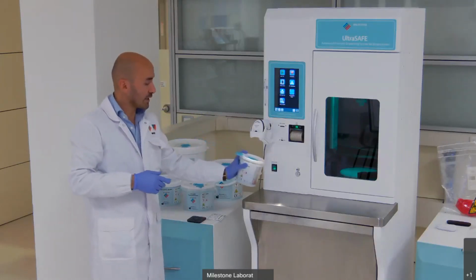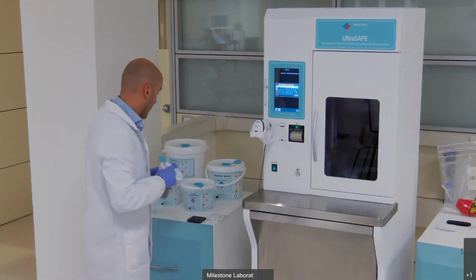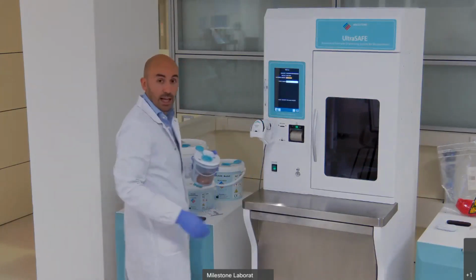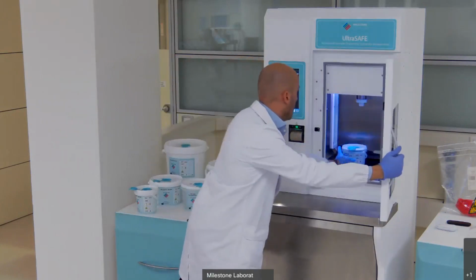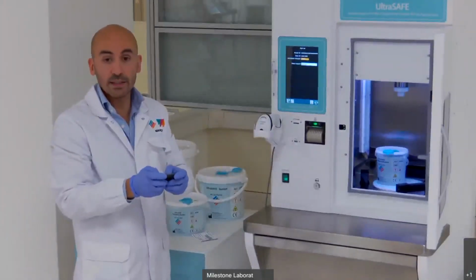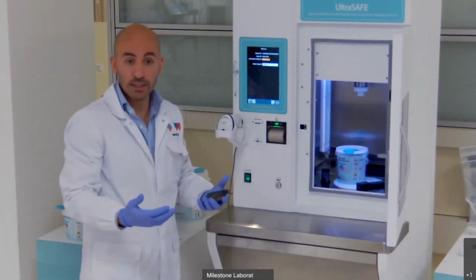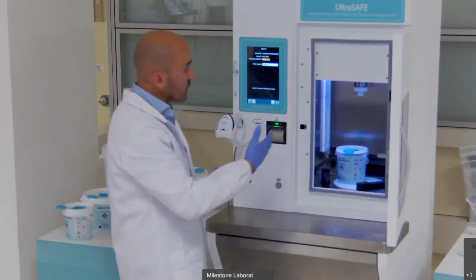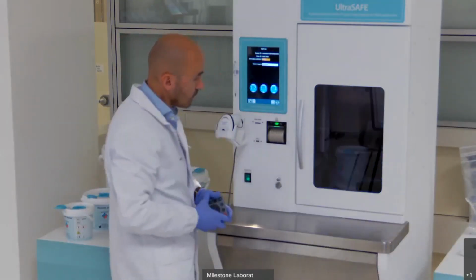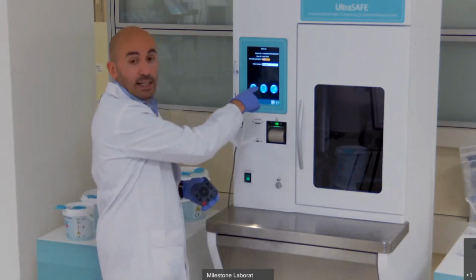As in the previous instrument, I need to scan one of the barcodes on top of the bucket, scan the requisition form of the patient, and place it on top of the scale. I will just slightly zoom to give you a better sight. I, on purpose, put it not in the center, it is off center, because one of the features is that the system will automatically center the bucket. Once the door is closed, I can select the ratio.